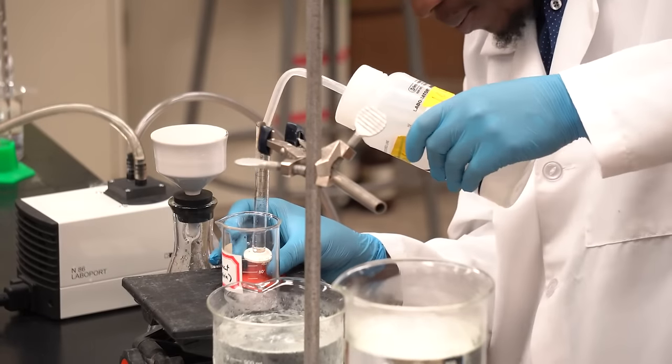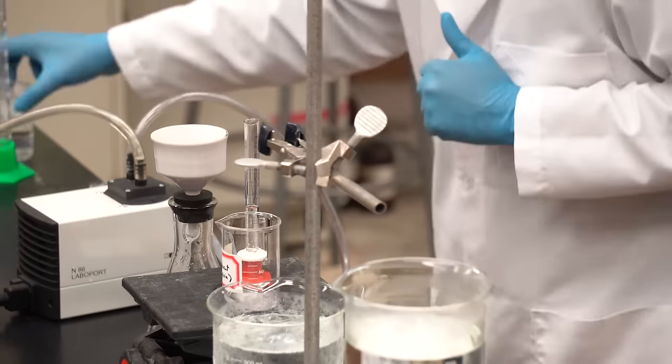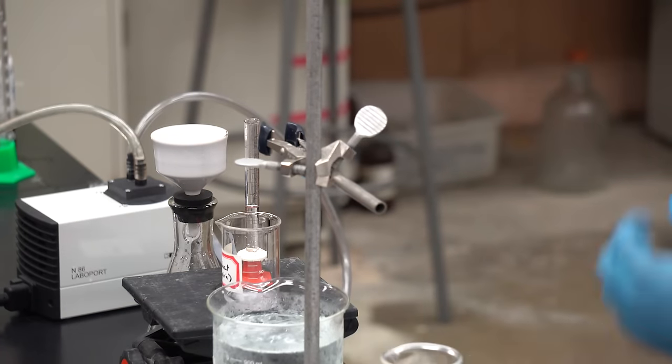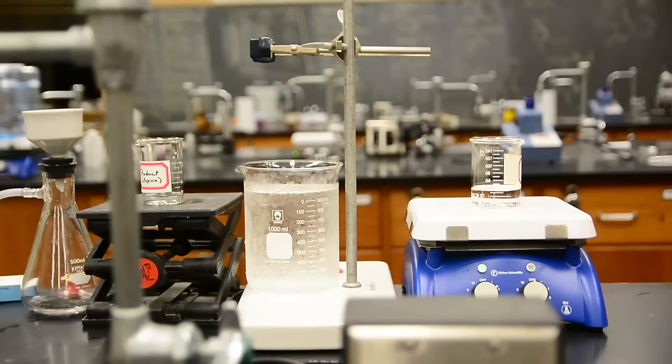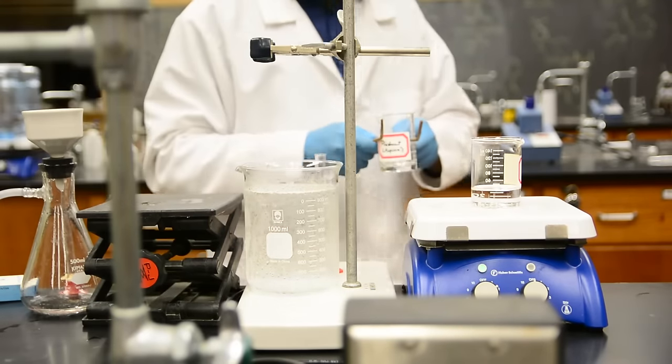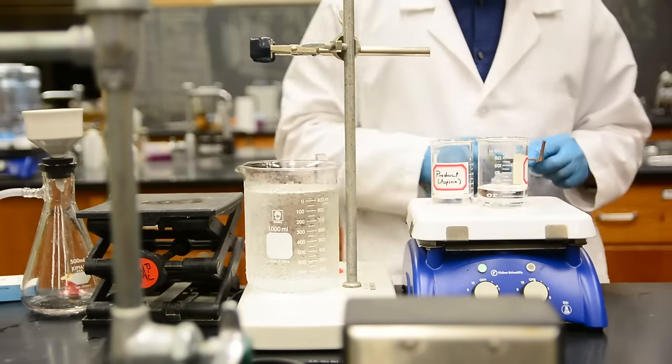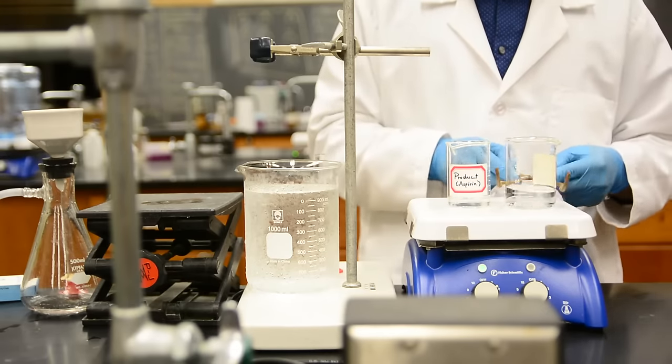Let's start by dissolving the impure aspirin in 5 milliliters of ethanol. While we do that, let's heat up some water on our hot plate. We'll then add 50 milliliters of hot water to the crude sample. This will start to dissolve. Let's then add the vessel to the hot plate and start adding more solvent.